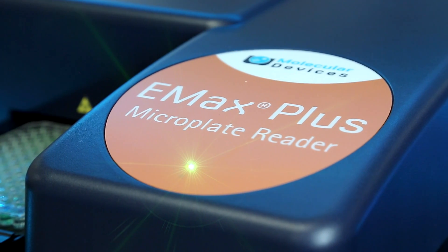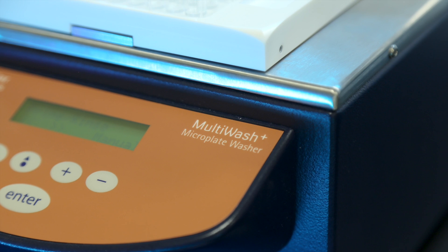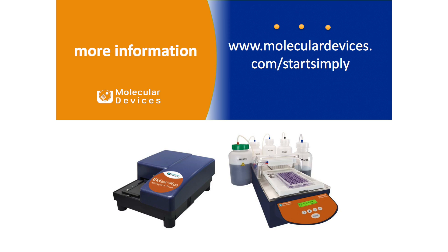The Emax Plus Microplate Reader and Multi-Wash Plus Microplate Washer offer a total solution to your ELISA needs.